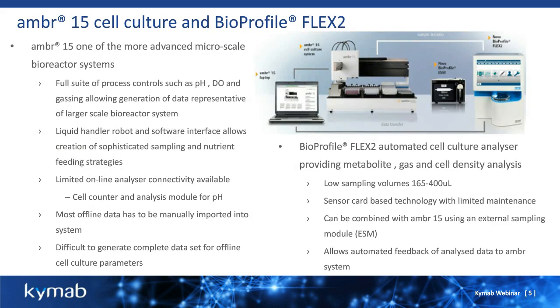So the ambr15 is one of the more advanced microscale bioreactor systems that's available. It offers a full suite of process controls such as pH, DO, and gassing, allowing the generation of data more representative of a larger scale bioreactor system. It has a liquid handling robot and a good software interface that allows the creation of sophisticated sampling and nutrient feeding strategies.